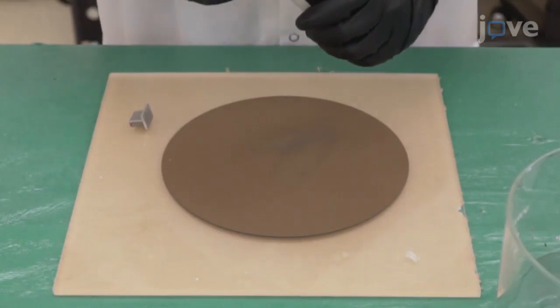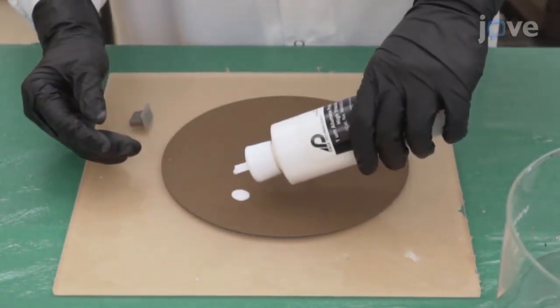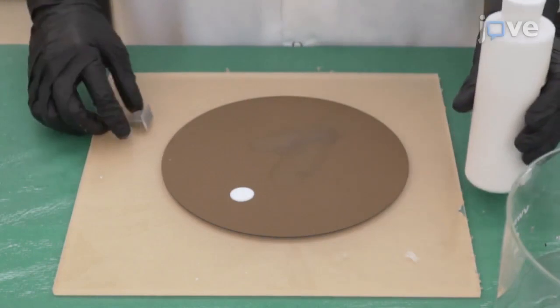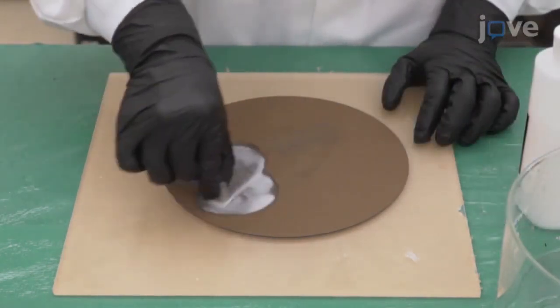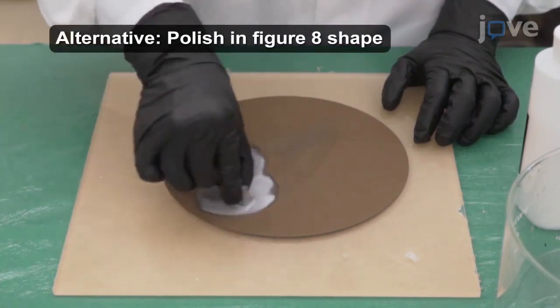After the last grinding, pour one ounce of a one micrometer alumina suspension onto a clean microfiber cloth pad and polish the sample in one direction until the scratch lines have been removed.